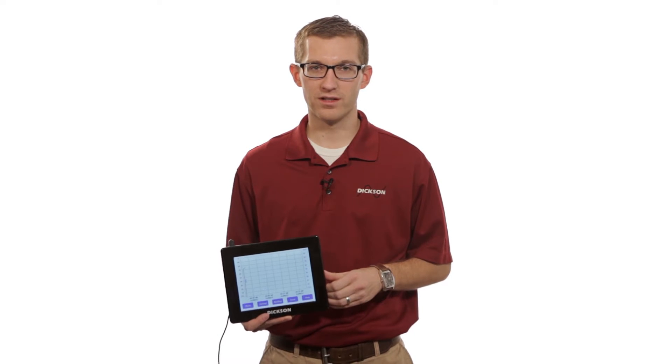Hi, my name is Nick. I'm with the Dickson Company. Today we're talking about our touchscreen data logger with our precalibrated sensor.